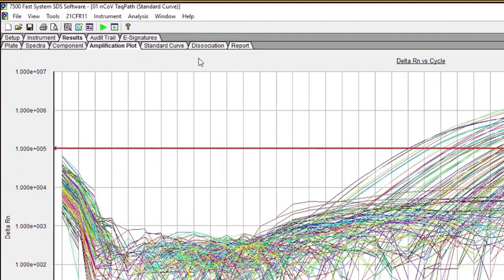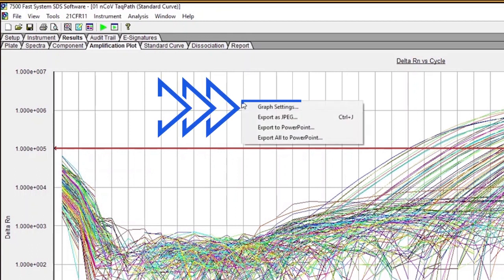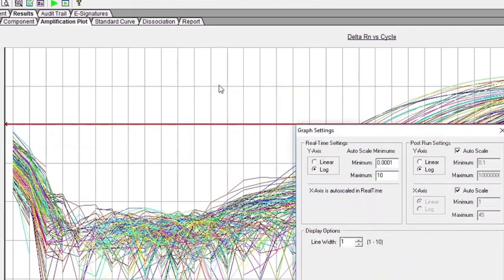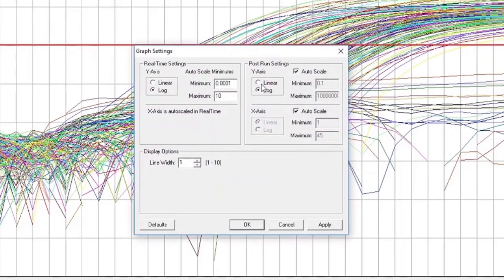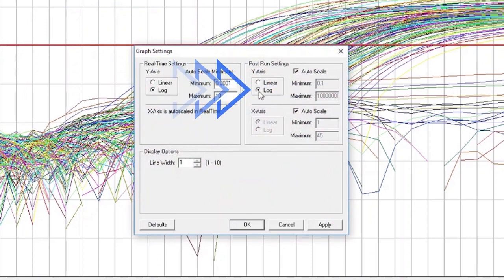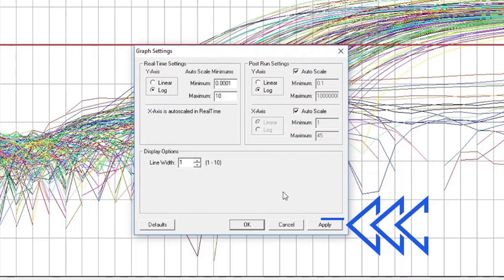If the data is currently in Linear View, update to Log View by right-clicking within the Amplification Plot. This will bring up a Graph Settings control box. For the Y-axis, if Linear is currently selected, select Log, and then click Apply to switch to Log View.